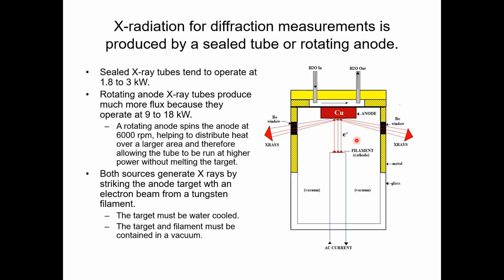Another precaution: this target is made of copper, and this filament is made of tungsten. Both of them must be contained in a vacuum.